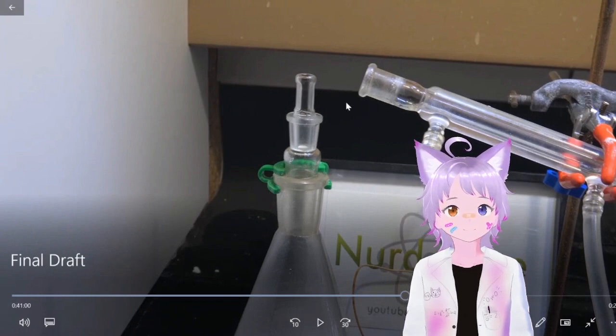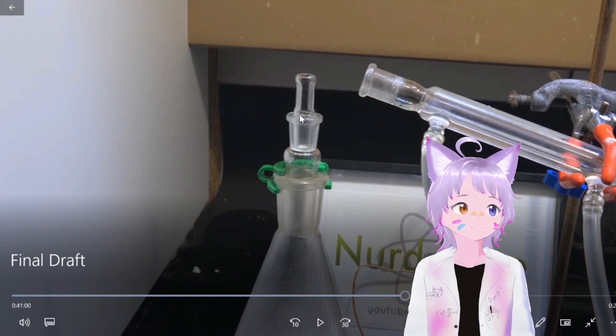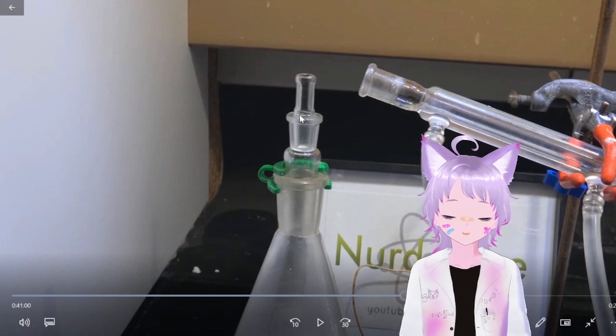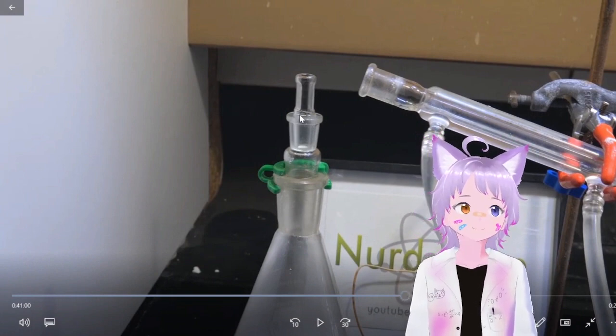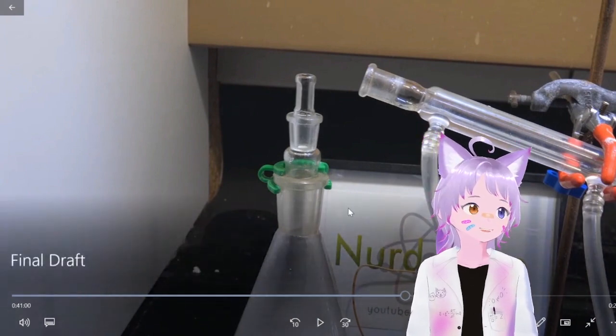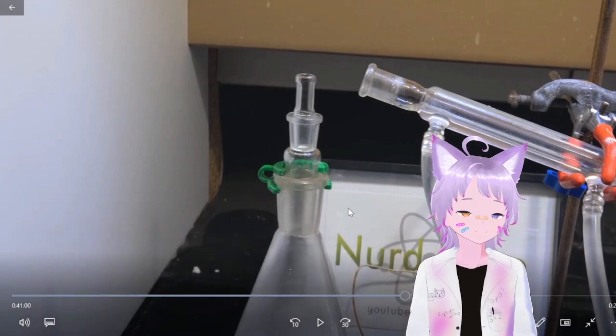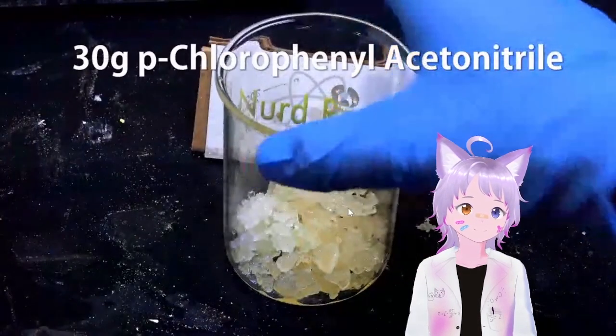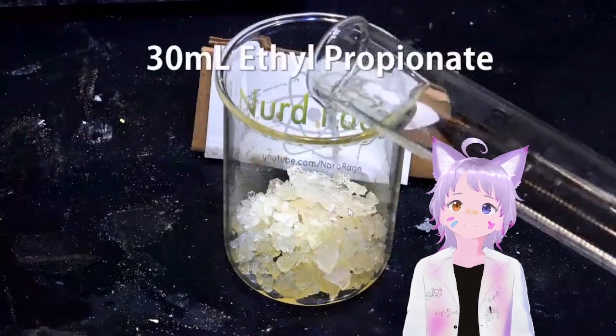If I were to open this flask in my humidity, that would be really bad. Yeah, you have to find a way to do everything in one step. I think an addition funnel is what you have to go with, with a drying trap attached to the end. Yeah. And have a Claisen adapter hooked up over there. Yeah, pretty much. While it's cooling, we can prepare our reagents. Get 30 grams of p-chlorophenyl acetonitrile, then add in 30 milliliters of ethyl propionate.